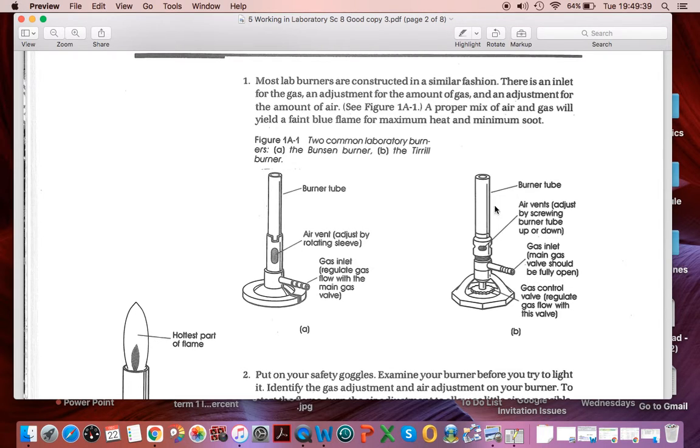Now, if you open it too far, the flame will likely go out, in which case you have to turn the gas off at the tap, get everything set up again to where you started, and reignite it.